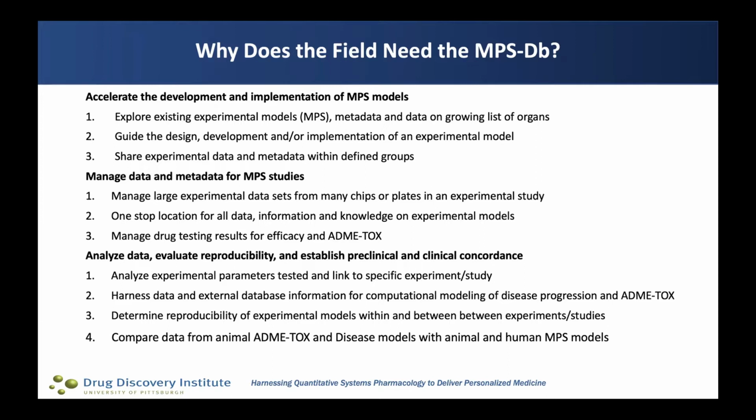And then finally, a variety of tools that are useful for analyzing the data, evaluating and comparing reproducibility, not just between individual models, but even between models that were produced at different sites. And we're in the process of developing tools to establish clinical concordance, which we think will be an important factor in terms of these experimental models becoming mainstream.